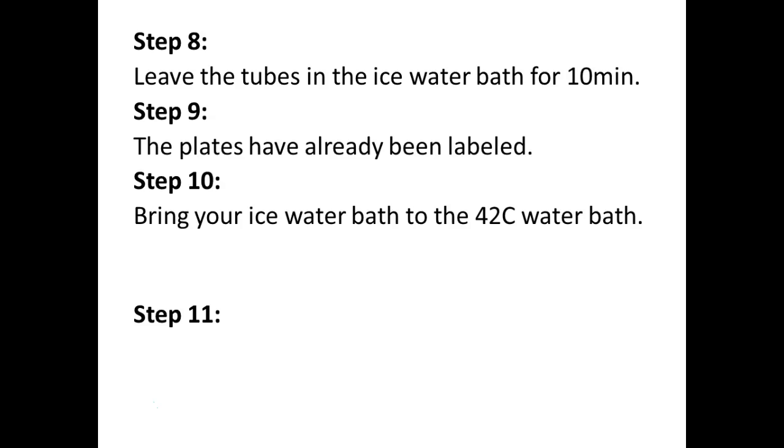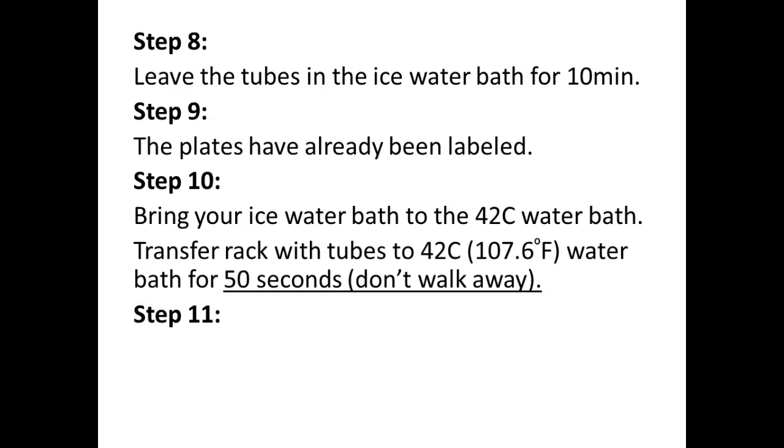You're going to bring your ice bucket bath to the water bath that you see in the back there that's turned on next to the racks and the refrigerator in the back. This is set at 42 degrees Celsius. You're going to pick up those little white racks that you see back there and take it right from your ice and put it into the water bath. You're only going to leave it in there for 50 seconds. So it's very important to not walk away. 50 seconds goes by very fast when you walk away. Trust me, I know this, right? Remember I said I did a lot of these, right?